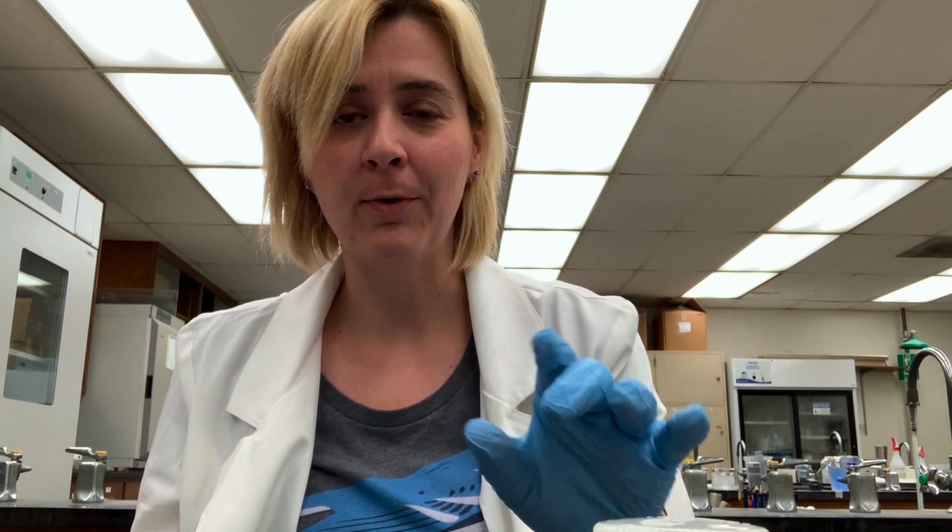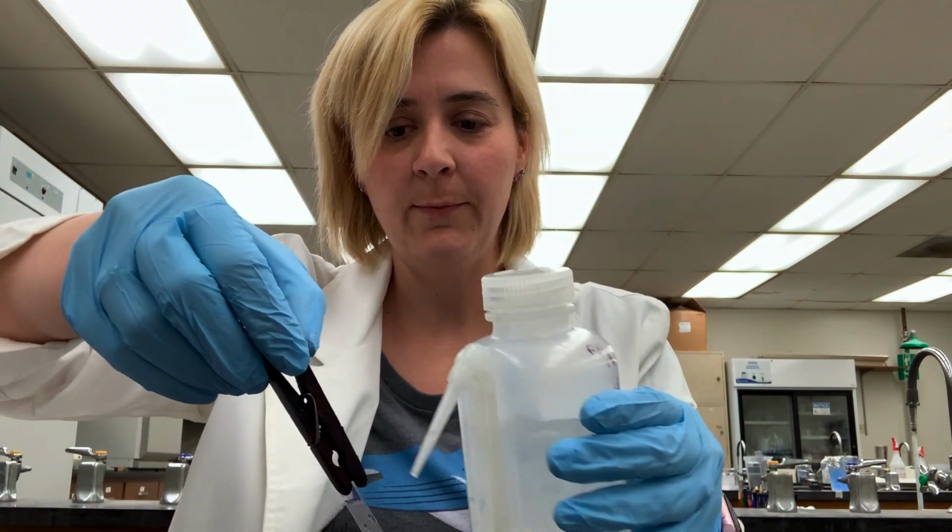away. If you don't decolorize enough, the gram-negative cells will still be purple. If you decolorize too much, the gram-positive cells will lose their crystal violet as well. So this is the trickiest step in doing a Gram stain. And so very carefully, I'm going to rinse the slide one more time with water.